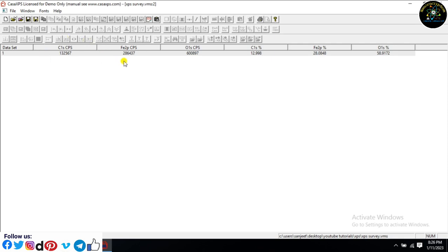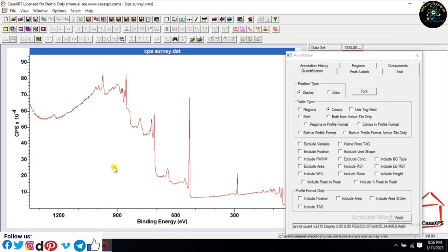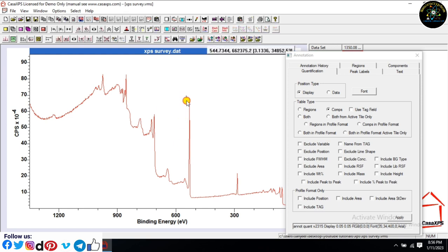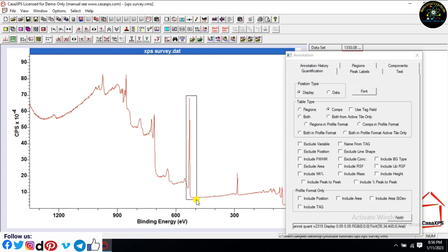Look at the atomic percentage of individual peaks. Again, I have applied the same process to estimate the atomic percentage of individual peaks.